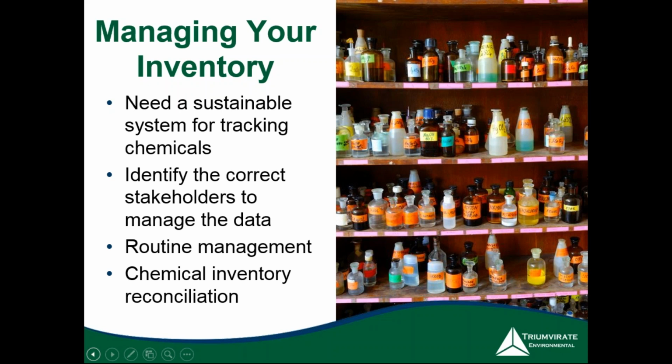And the managing of chemicals coming in and out is more of just the day-to-day management of doing chemical inventory. So I'm not sure if that makes sense. Maybe I just confused more people there.